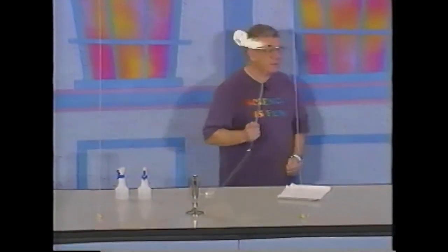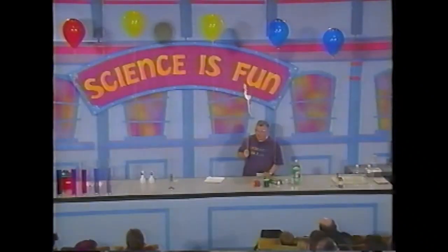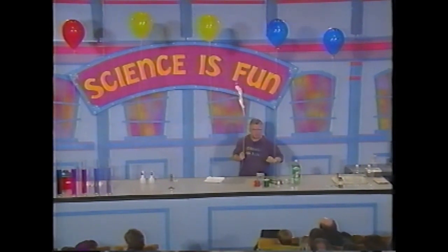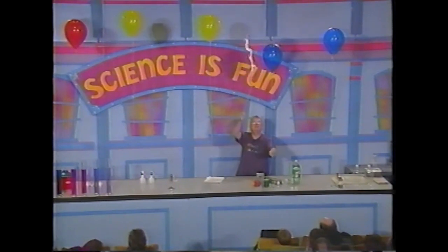All right? So I'm going to come over here and try to reach for this balloon and ignite it. I see that some of you are covering your ears. Why are you covering your ears? Because you know from experience, there's that word again, that there might be some sound energy given off in addition to the light energy that we get from the combustion reaction. So, here we go. Are you ready? That balloon popped. That balloon had in it the gas helium, and helium is a gas that does not burn.